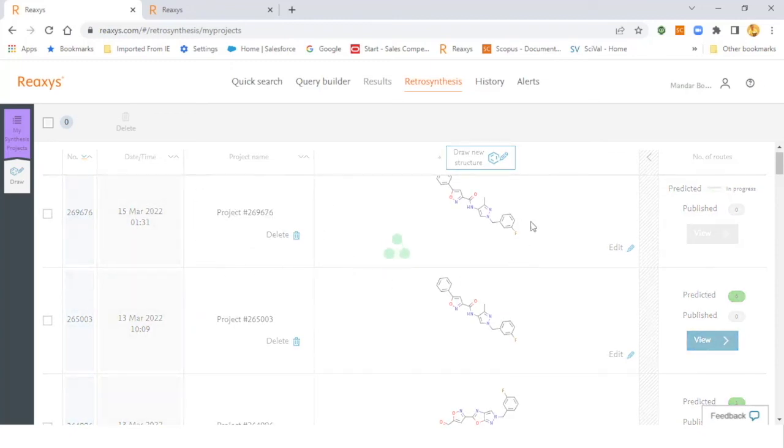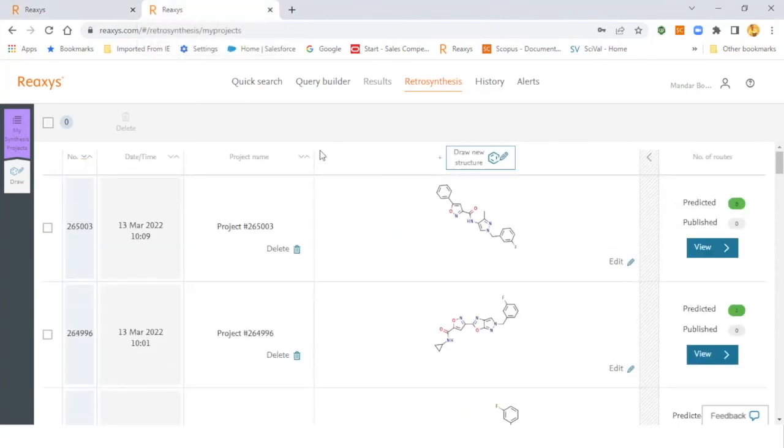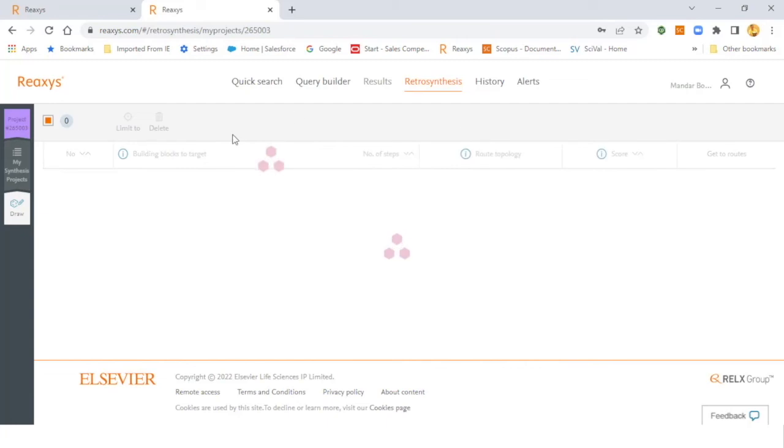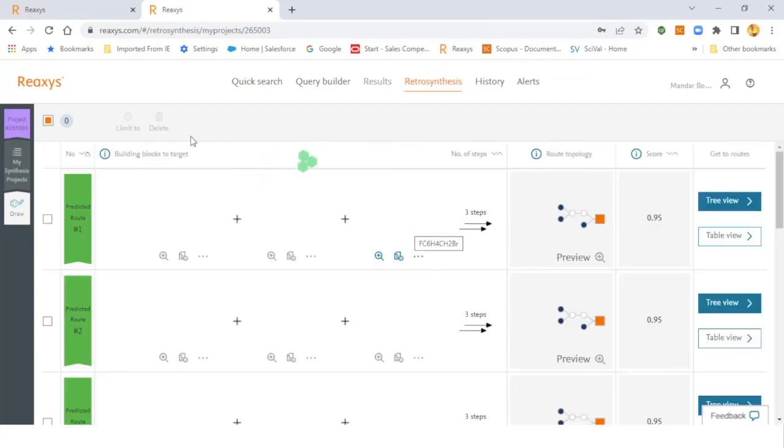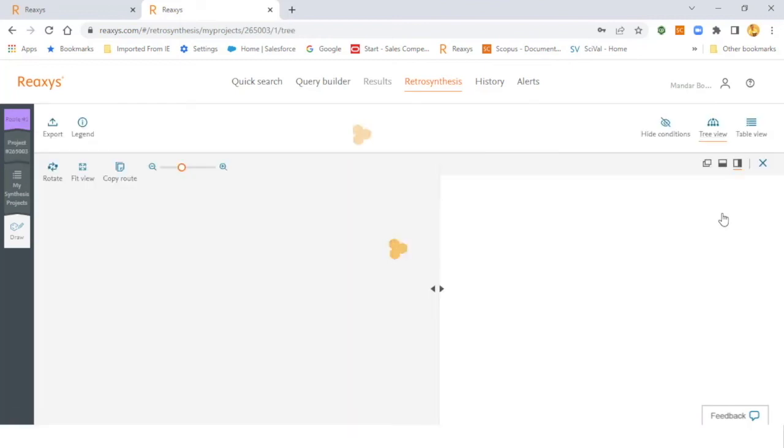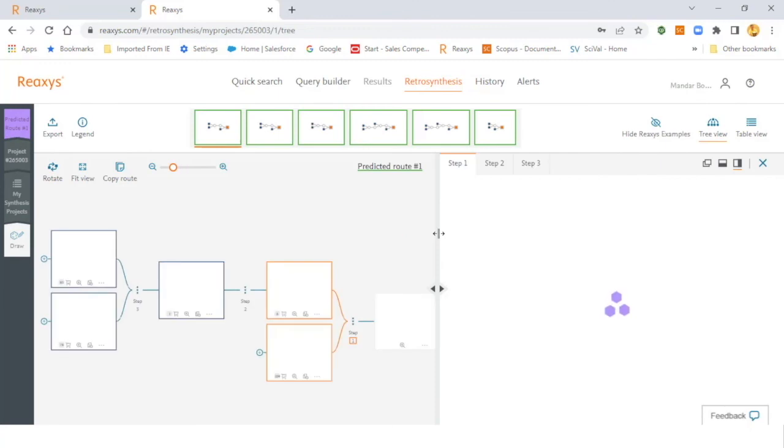You can then review your synthetic routes, which I have already done in another tab. You can click the review button. Once you see all the routes, you can also see the number of steps, the divergence, convergence of synthetic route and the confidence score of each and every predicted route. You can then click preview to go into the retrosynthesis routes.